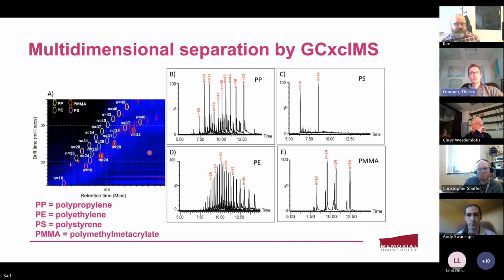And in terms of instrumentation, when you do APCI, there is no need for any gas, right? You don't add any methane or propane or ammonia. With the AP, it's enough to have ions. So we're working under charge exchange conditions under nitrogen. Okay, so N2 and N4 plus. Oh, there's a question from Chris. Yeah, I think, yeah.